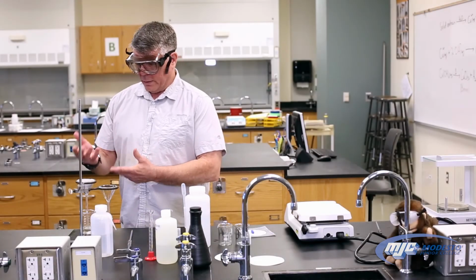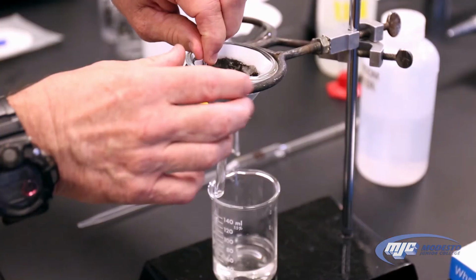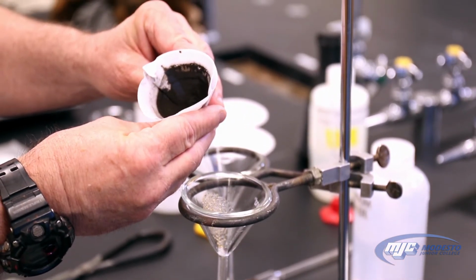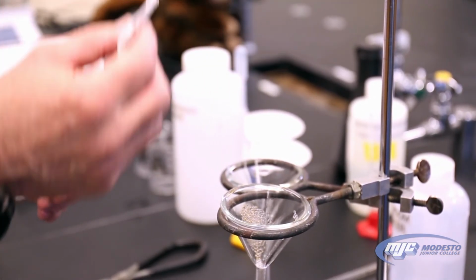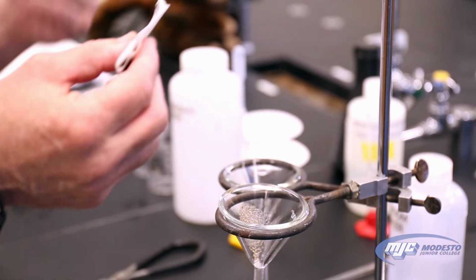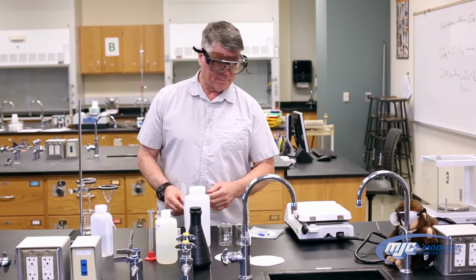All right, guys, so now that it's finished filtering, all we have left to do for part A is take the filter paper out of the funnel, and you can see that there's the copper two oxide. It's still wet. So all we do is we fold it up like this, and we're going to go place it in the oven. Come back in about a week, weigh it, it'll be dry, and that'll be all we need. So now we're ready to go on and do part B.